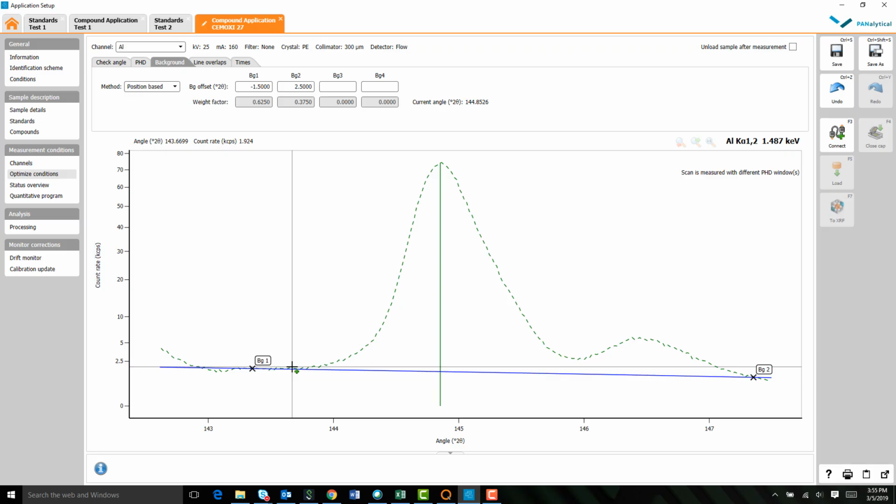If you don't put it in and you do the calibration and your D value is slightly higher or lower than 0, and you trace it back to the backgrounds when you're optimizing the condition, you could come back and put it in, but if you put it in after running the standards, you'll have to run them again. So it's better to put them in and then just to turn them off when you're doing the calibrations.